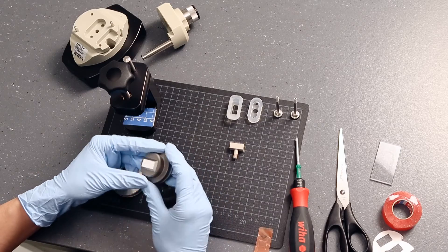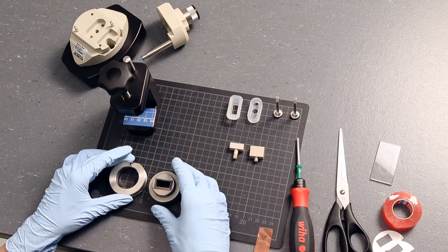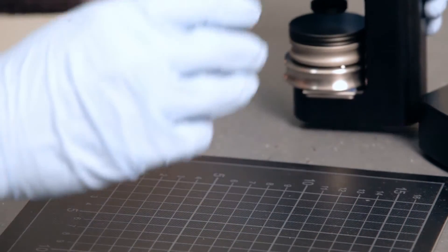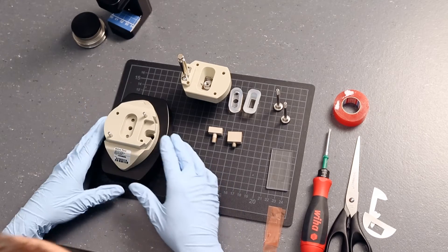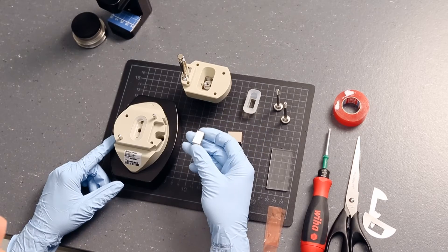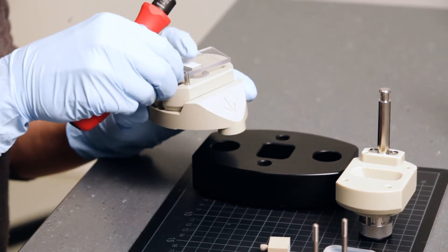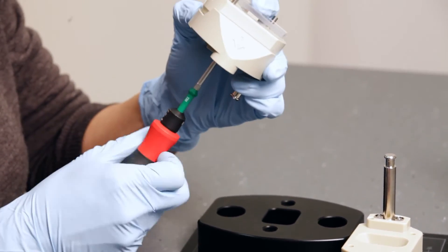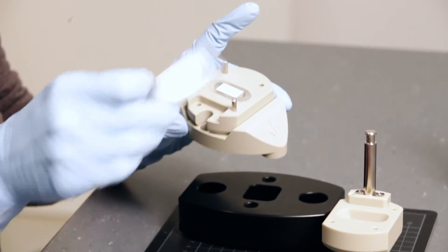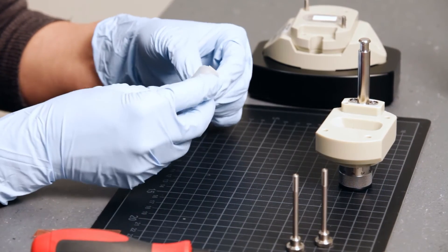Use the support plate for mounting so you do not touch the sample surface. Insert the second sample holder into the gasket and pull it in completely.